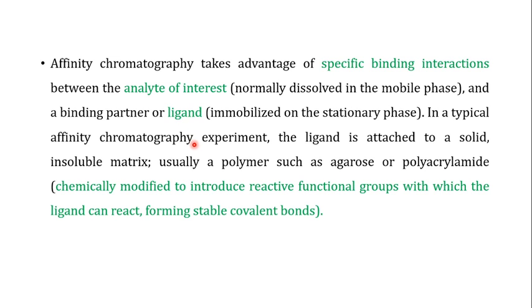Now, in a typical affinity chromatography experiment, these ligands are attached to a solid insoluble matrix. We will have a detailed discussion on the matrix in the slides to come.